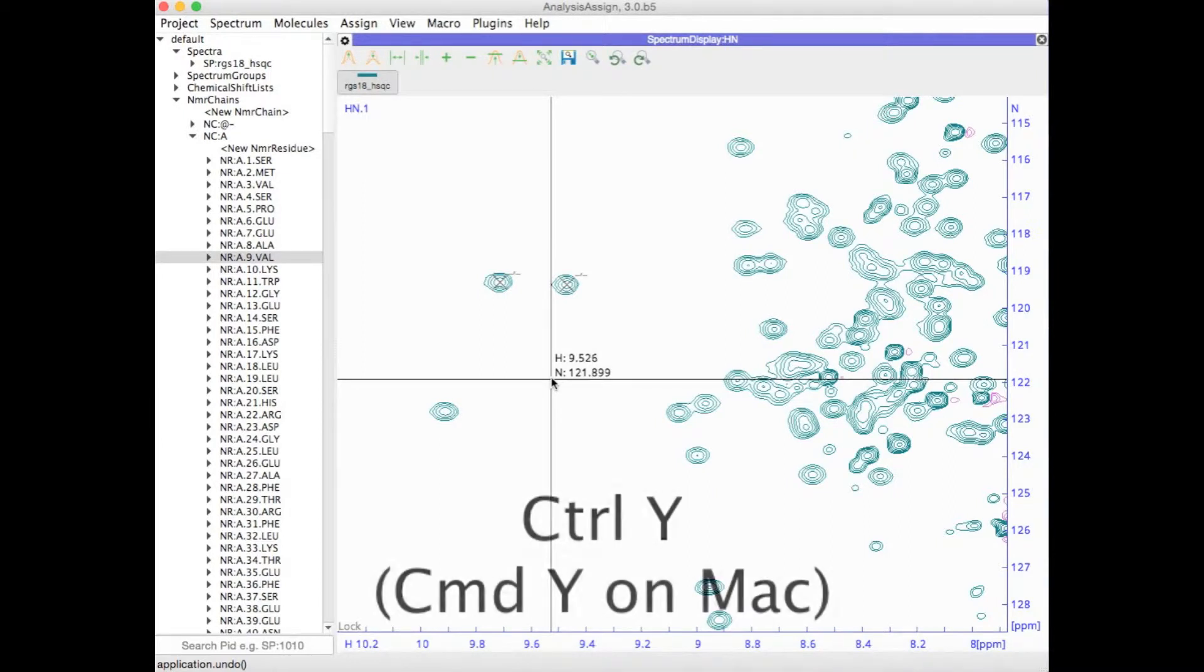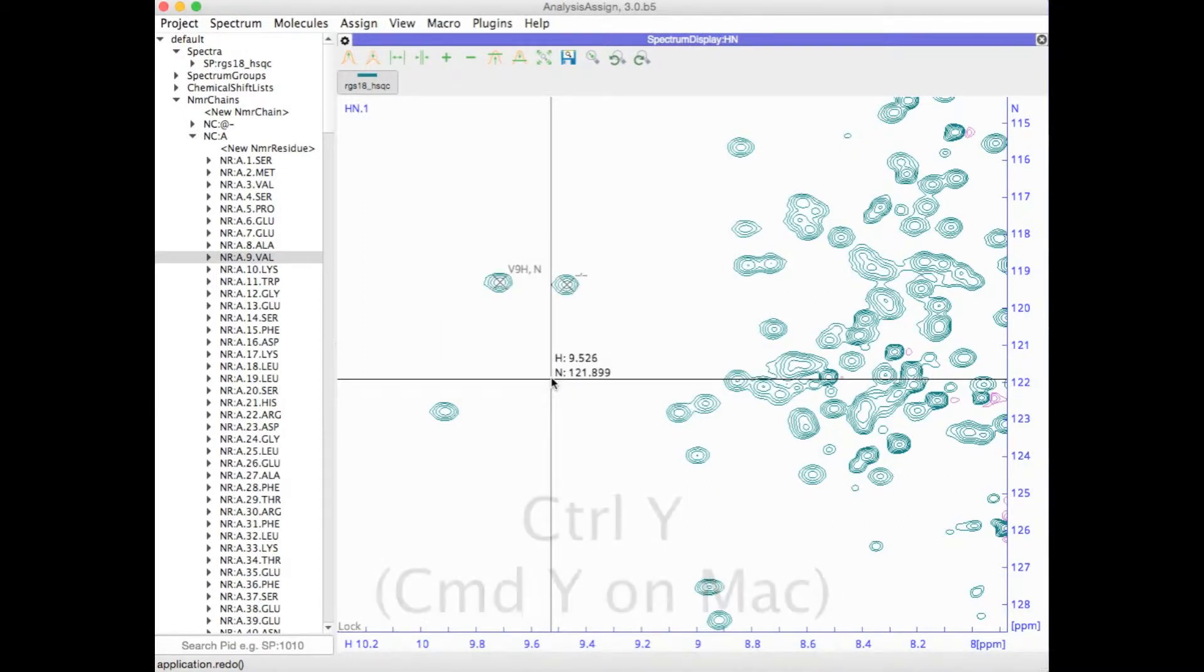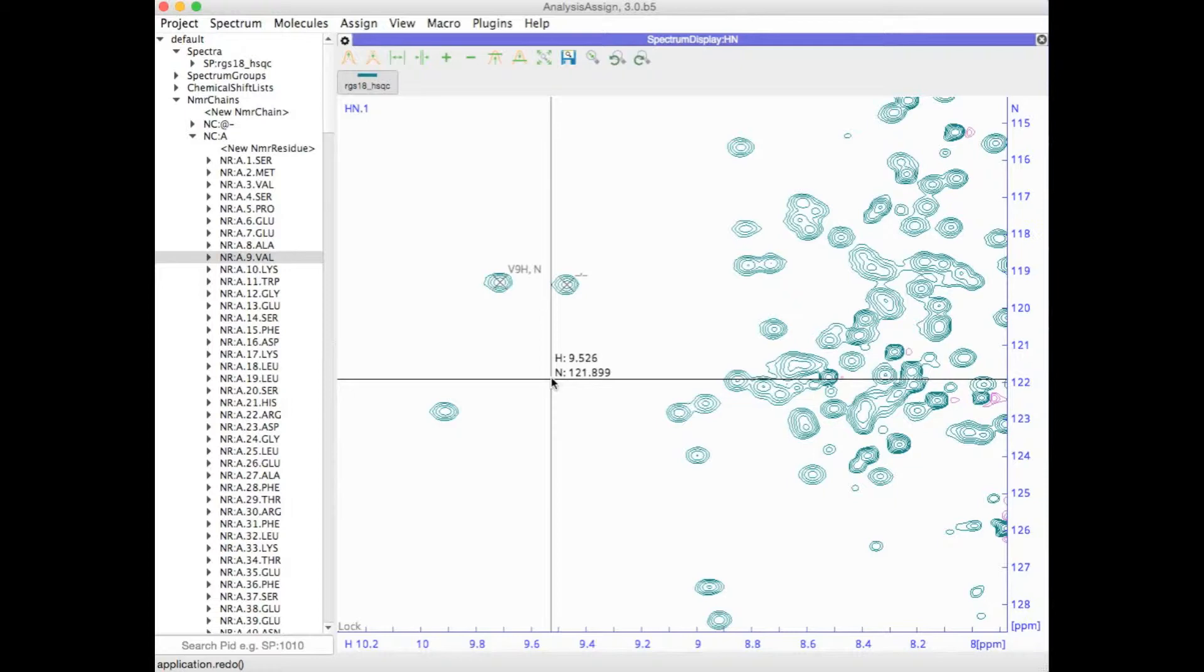By typing Control or Command Y, you can redo the action again. Nearly all the tasks that you might perform in Analysis can be easily undone and then redone again.